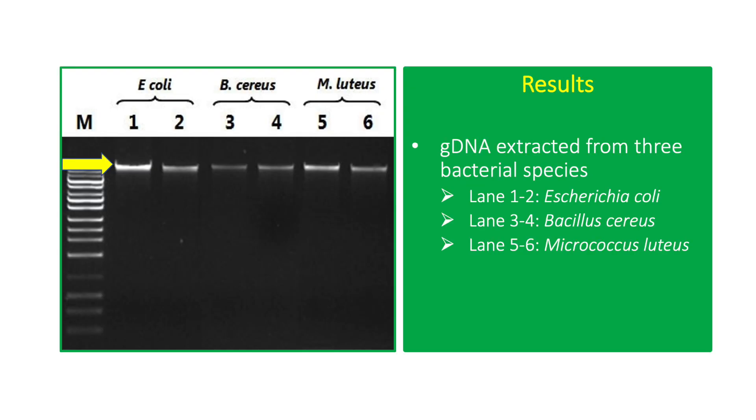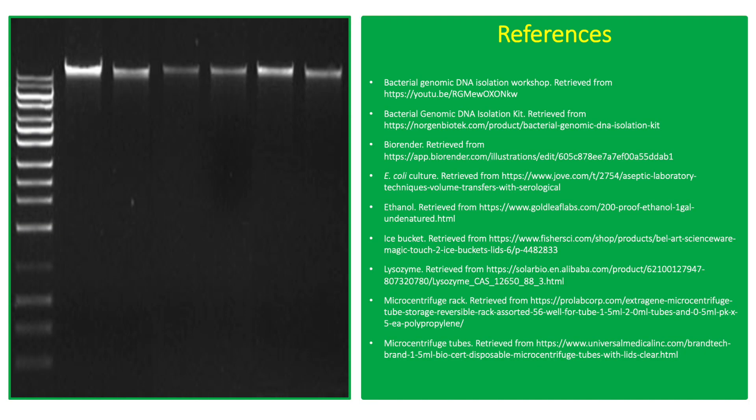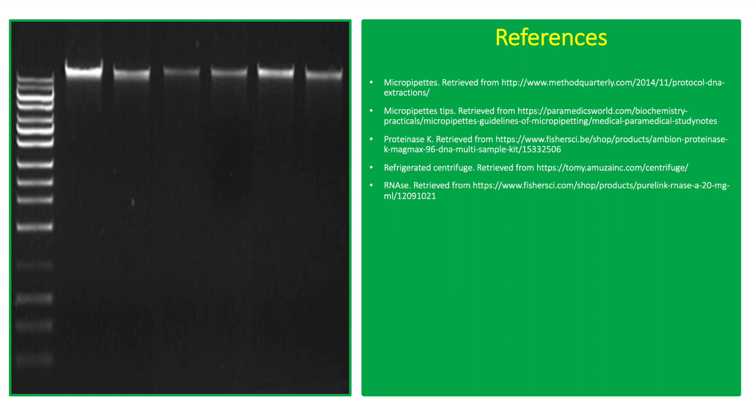The results show gDNA extracted from 3 bacterial species using the DNA extraction kit. Lane 1 and 2 are from Escherichia coli, lane 3 and 4 from Bacillus cereus, and lane 5 and 6 from Micrococcus luteus. There is no visible gDNA degradation or contamination, suggesting high quality DNA.